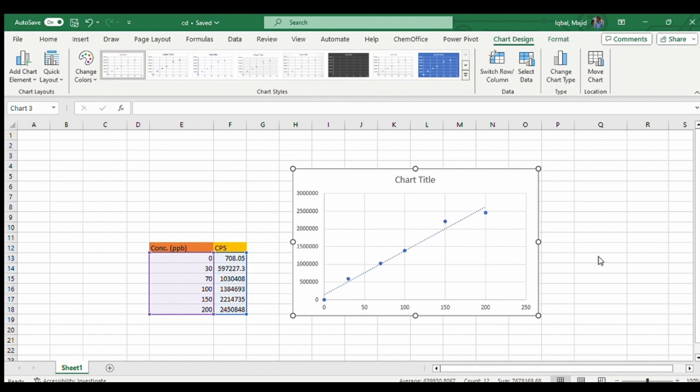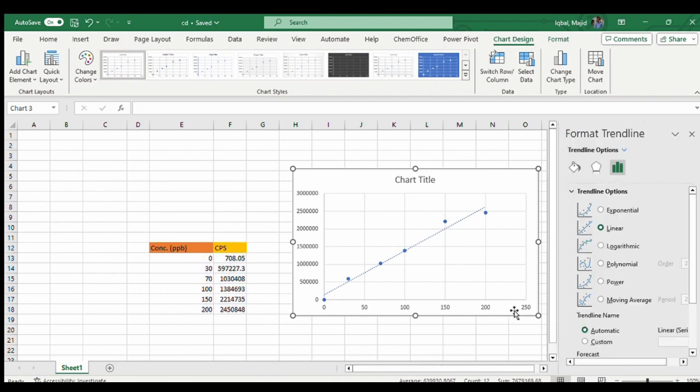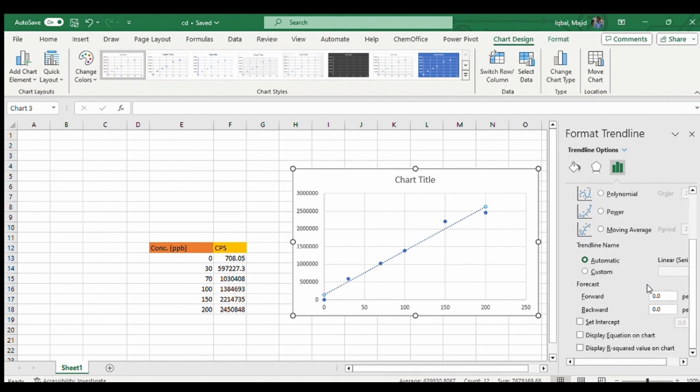To get the equation of straight line, you have to go here and then more options. When you drag down you will see display equation on the chart. Click on that and then display R square value.